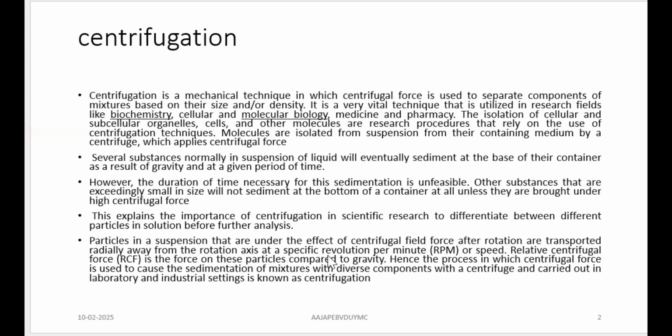Now, when the particle is running in a centrifuge, it is acted upon by centrifugal force. True. But at the same time, gravitational force is still acting on it, right? So in correlation with gravity, when you talk about the effect of the centrifugal field, it is described as relative centrifugal force, that is, you are comparing with gravity. That is described with a small letter g, that we have to understand.